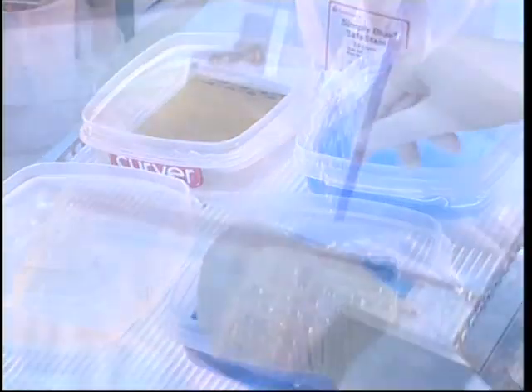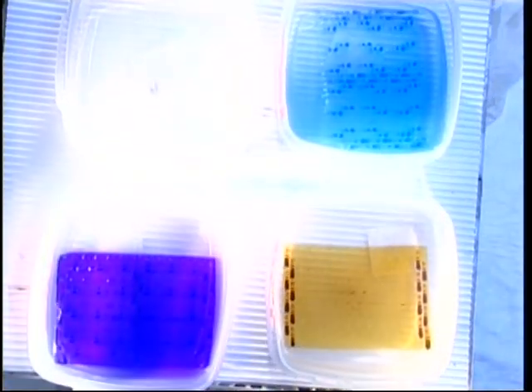Would you prefer staining or blotting? Both are easy to perform.